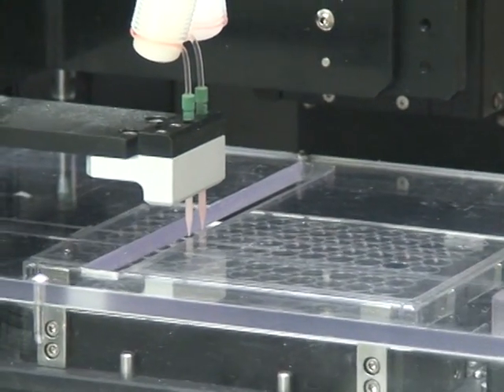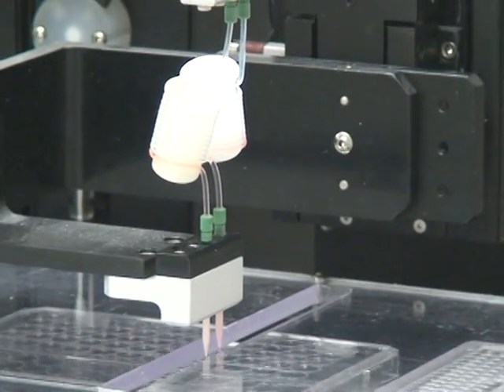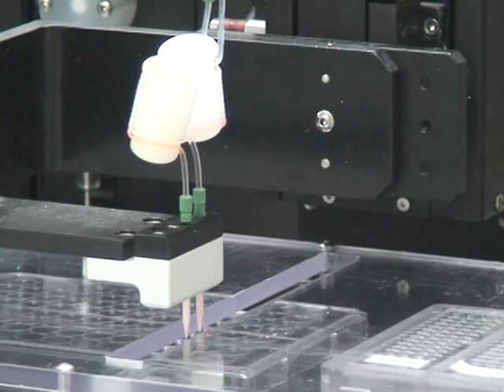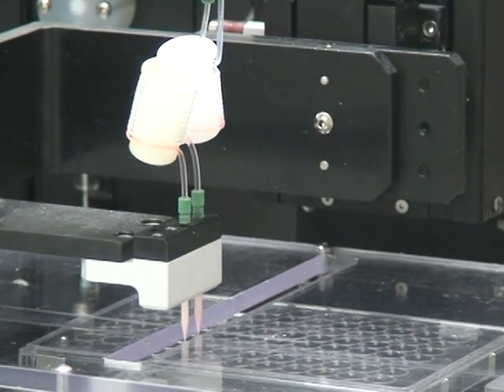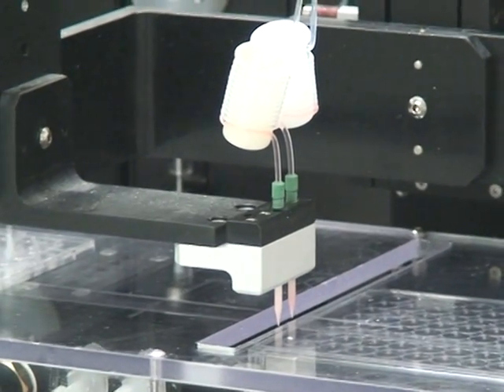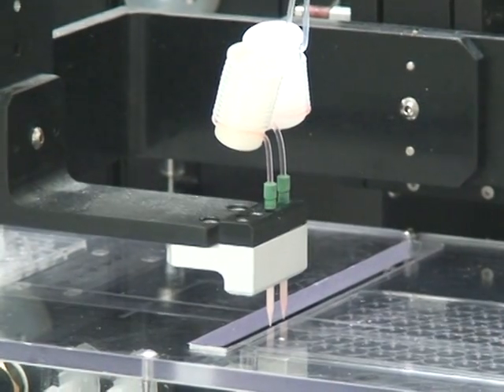You can see that on this device we have configured it with coiled lengths of tubing, which serve as a reservoir in the case of aspirating and dispensing samples, where we can pull the cellular material into the coil tubing, keeping it away from the microsolenoid valve and then dispensing very quickly onto any substrate.